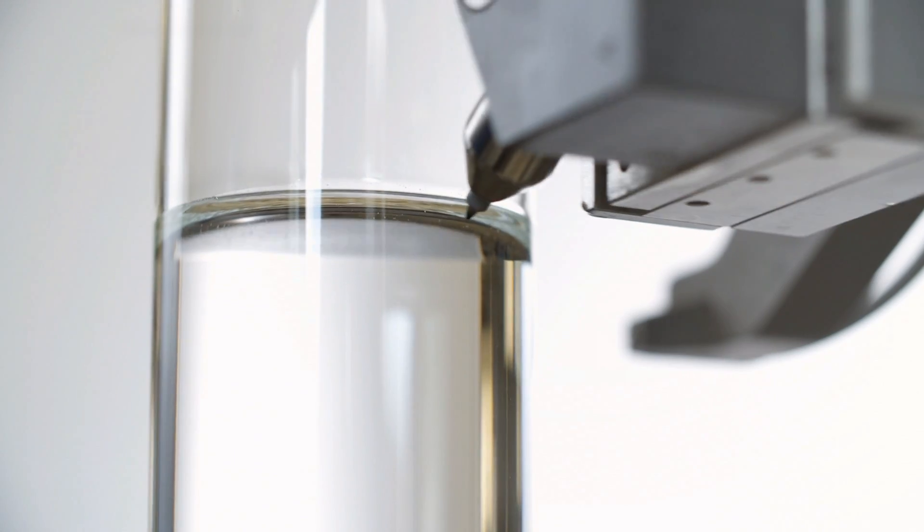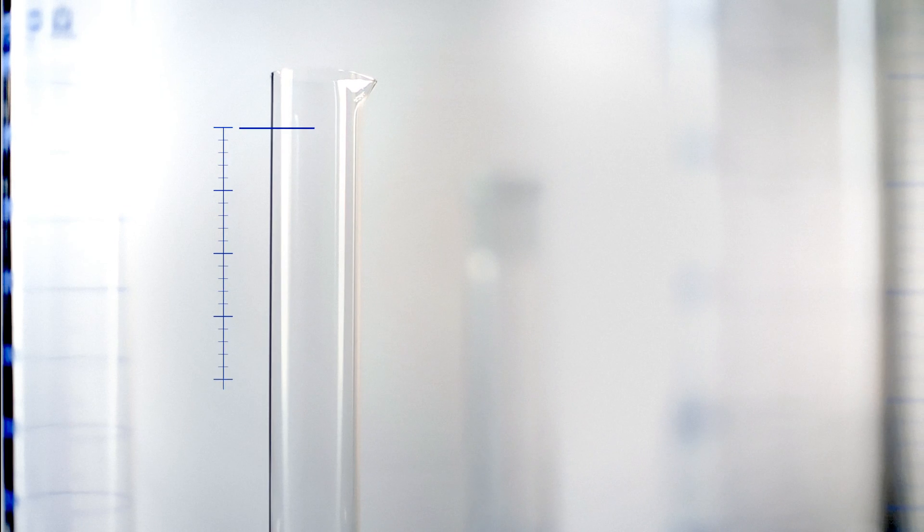Products with an indicated scale have multiple measuring marks to ensure optimal precision over the entire graduation.